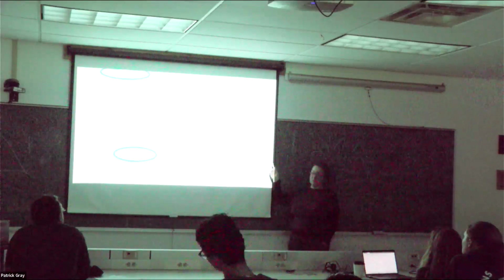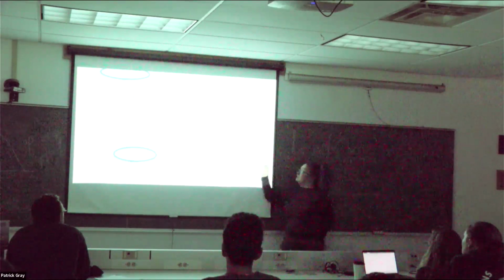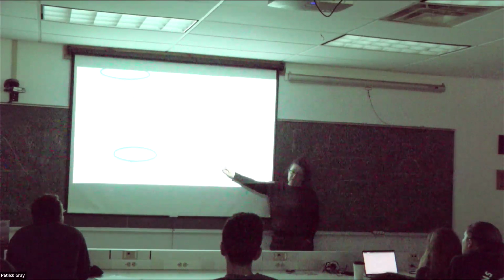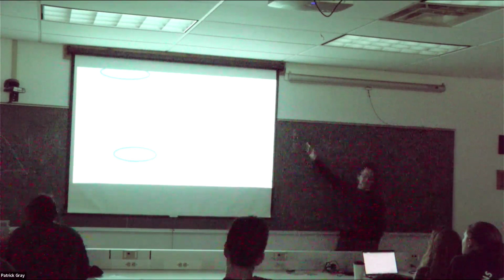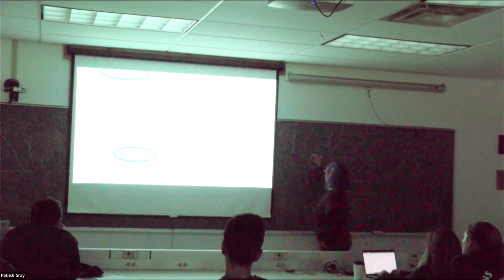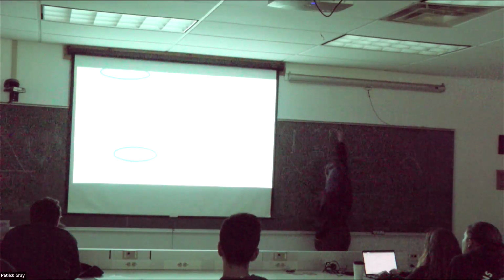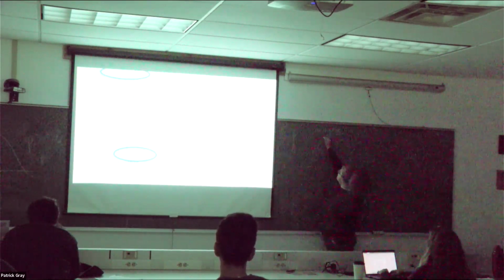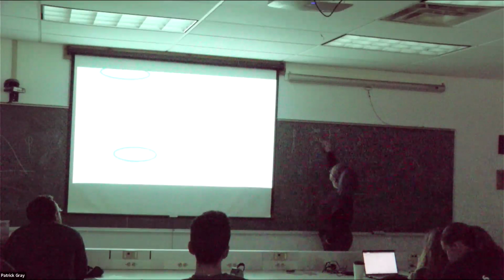I know the quantum yield of fluorescence for these guys, so I'm going to calculate the concentration of pheophytin and the concentration of chlorophyll, and the difference in these two things is going to be chlorophyll. Because in the first solution, I had chlorophyll plus pheo, the degradation pigments of the chlorophyll. In the second solution, I killed all the chlorophyll and made it pheophytin.